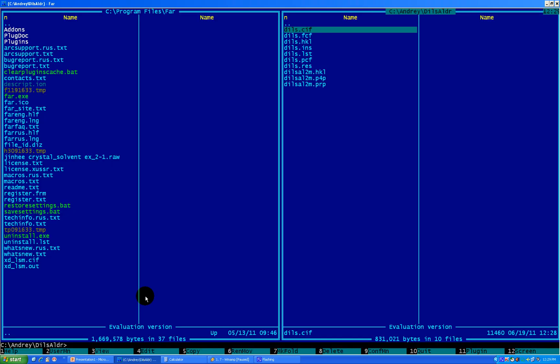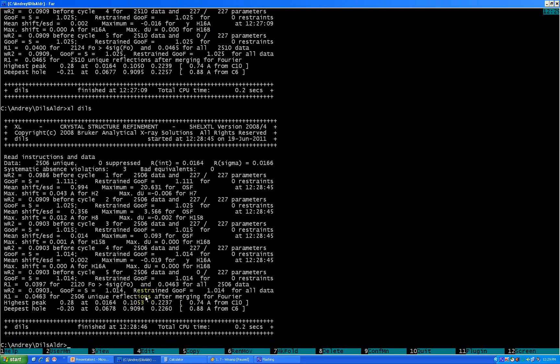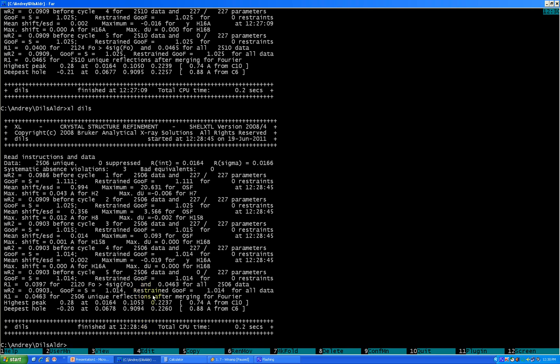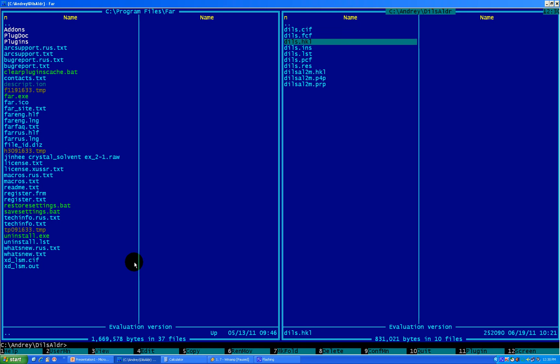We're done working with our GOOF and done with deleting bad reflections. We finalized our structure. Right now we need to actually fill our CIF file. Actually, we didn't fully finalize it, because you can see the maximum shift is still not zero. So how can we correct that? Well, you can correct it in a lot of different ways. One of the easiest ways is to copy RES into INS.